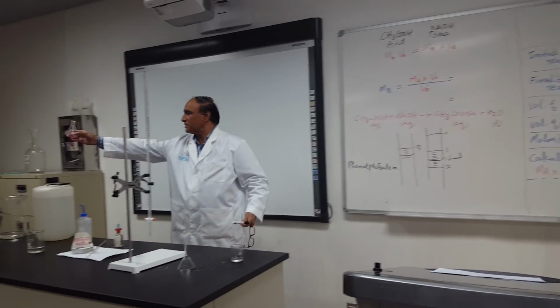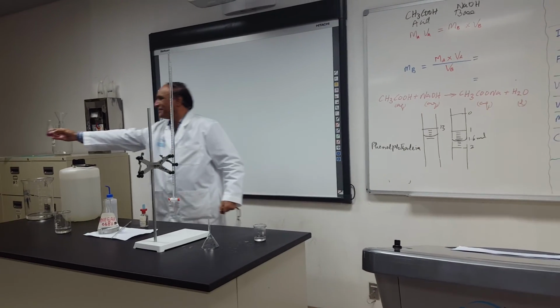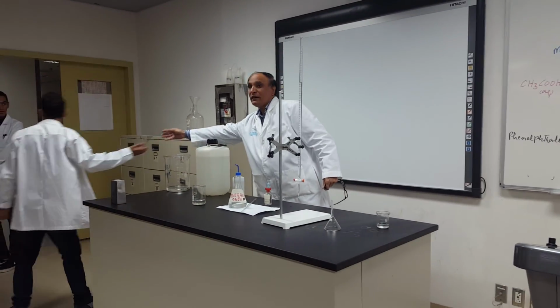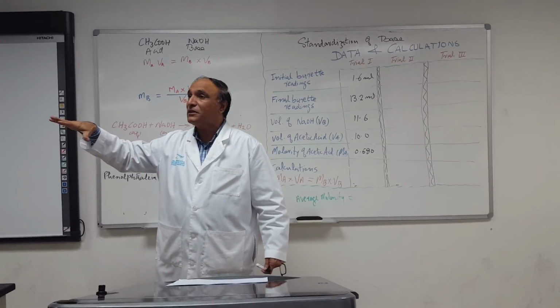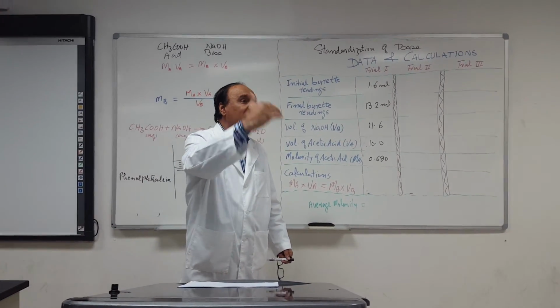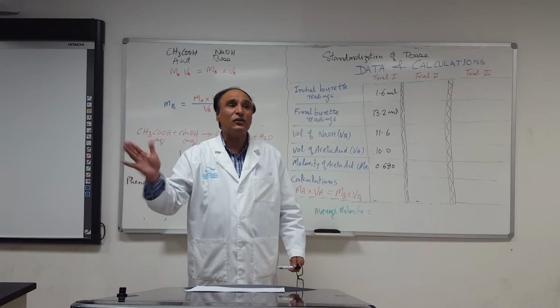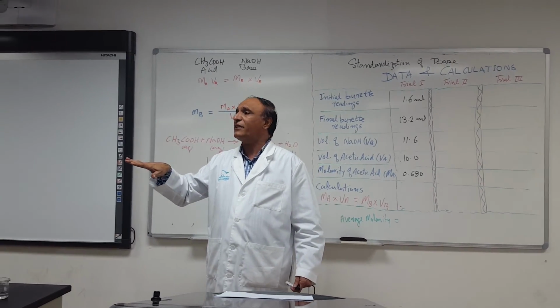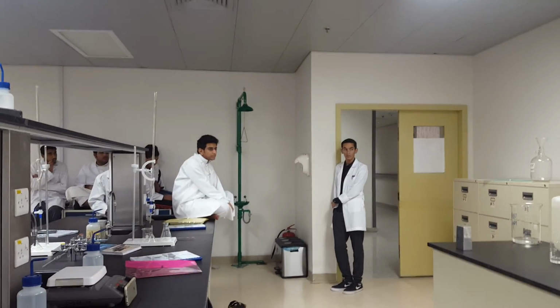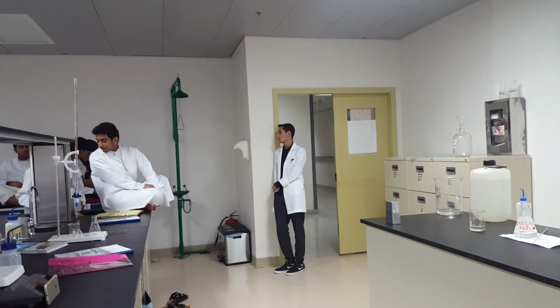Please wash this one. Me. Wash. And when I do the second time, you will learn. It is not the same. You will learn so many more things. Very interesting thing you will learn. It is not exactly like before. So make sure that you don't use distilled water. Why? Just wash with the tap water. Just tap water.